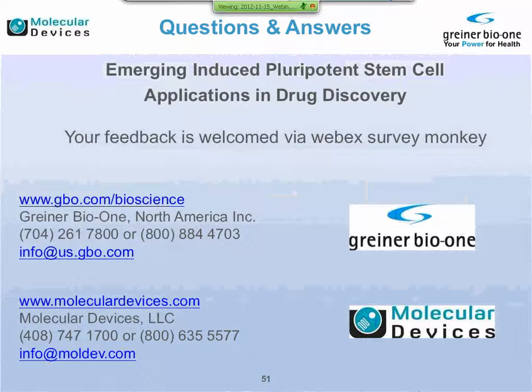I'm sorry. So the next question I got was for Kathleen about the paradigm system. When you're reading on the fly, will you touch the walls of the well, and is there a possibility of getting a false signal?